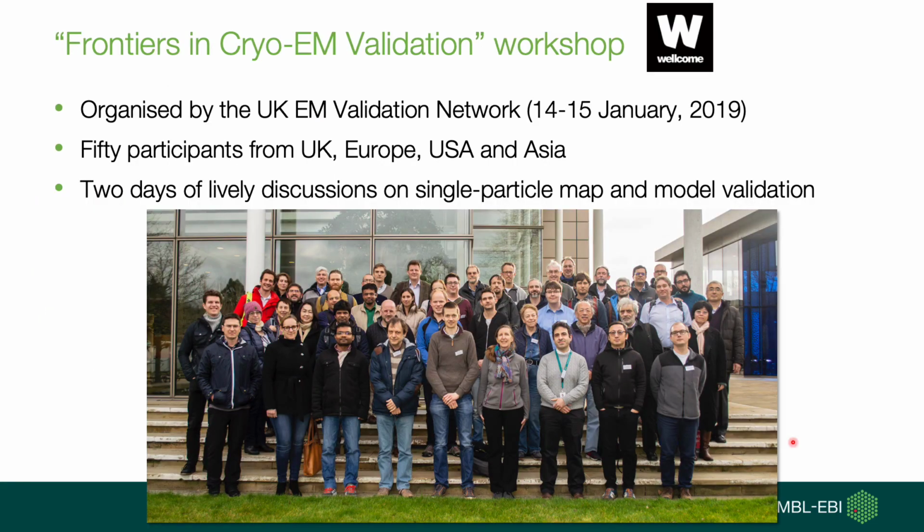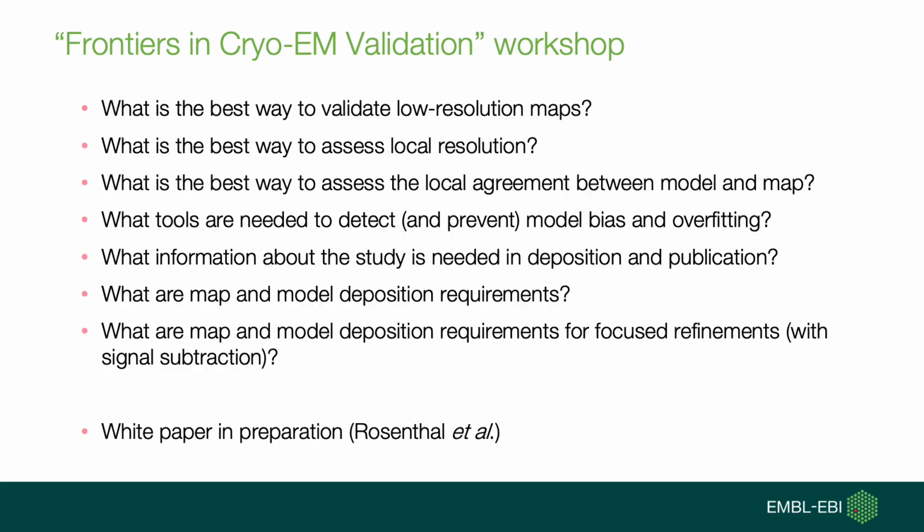So in 2019, the UK EM Validation Network decided to organize a forward-looking workshop. Where is EM going? What are the unanswered questions for validation? What should we be focusing on? So we invited 50 people from all over the world and had 2 days of very good discussions on single particle map and model validation.